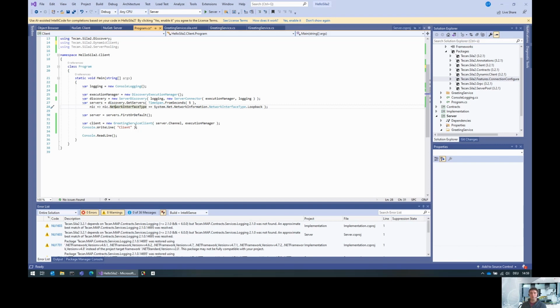And what we'll do is we'll spawn a pool server, which is the concept in the SiLA 2 SDK for basically a pool that servers can connect to, and start this pool, connect to the server, and tell the server to connect to the pool, and then react to the pool getting a connection from the server, and then also saying hello from the pool.